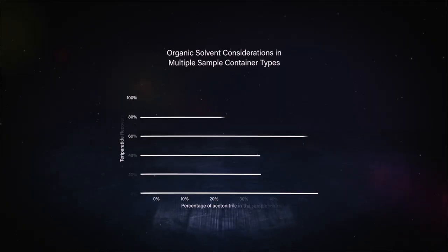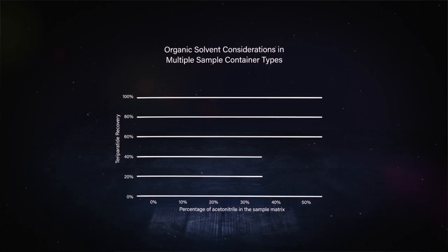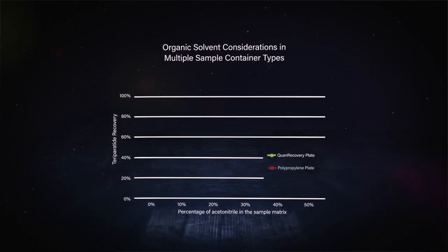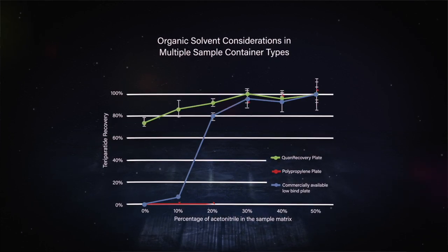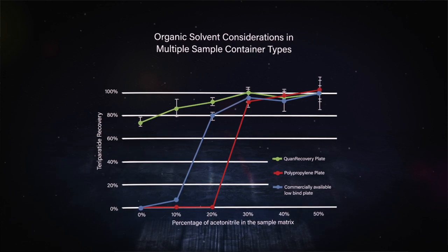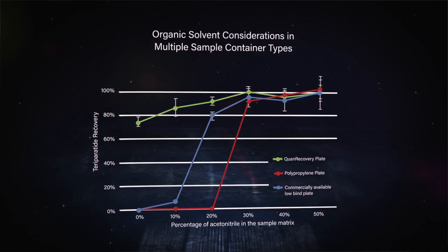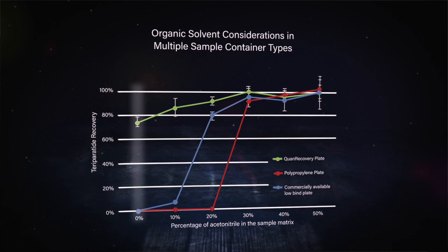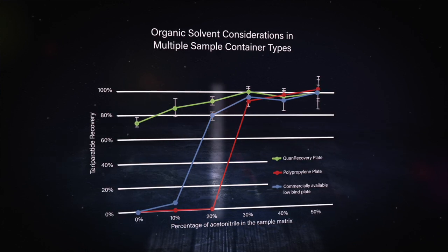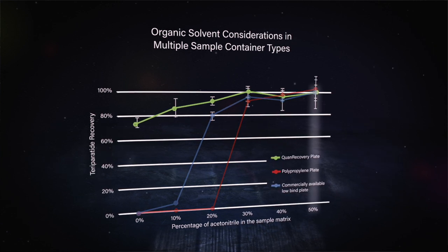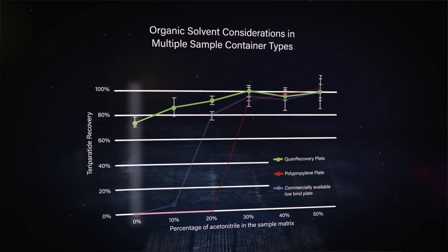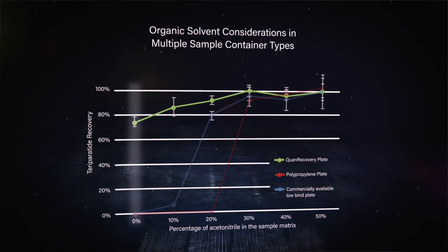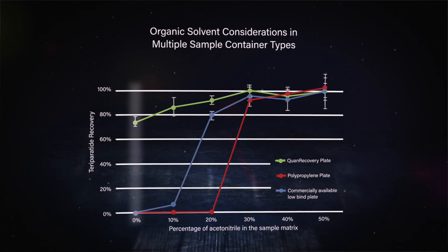So Kim, how did the results look from that experiment we set up? Sure, so we ran the three different sample containers: the Quan recovery plate, a polypropylene plate, and a commercially available low-binding plate for comparison. We injected the teriparatide and looked at recovery in each container. As we move from zero percent acetonitrile up to ten, twenty percent and so on, you can see some real differences in recovery. With the Quan recovery plate, even at zero percent acetonitrile, we're getting some recovery of the teriparatide, where we're actually not seeing that in the polypropylene or the commercially available plate.